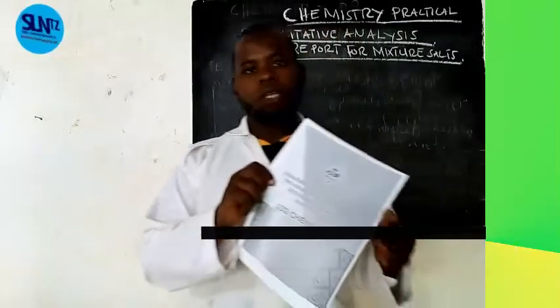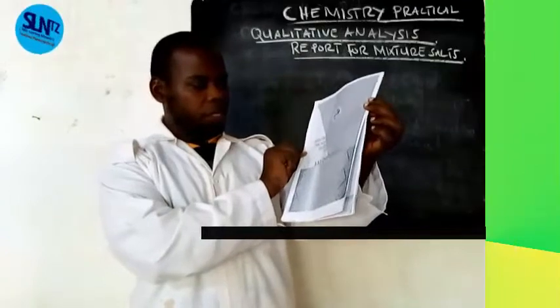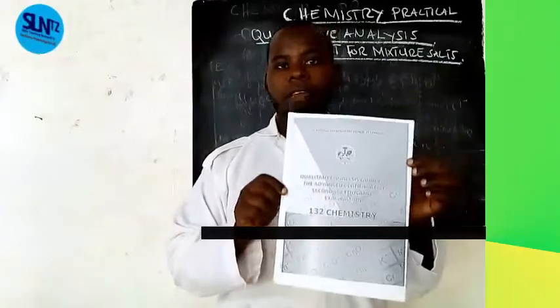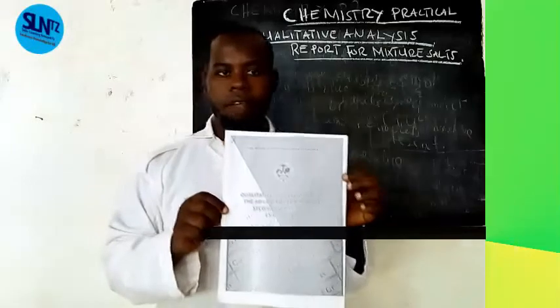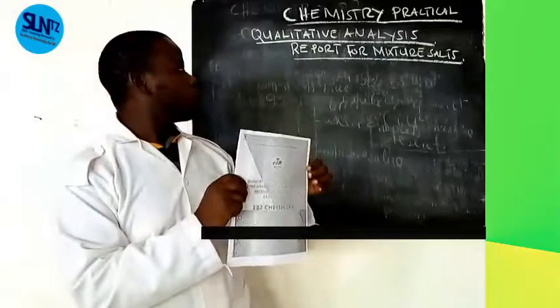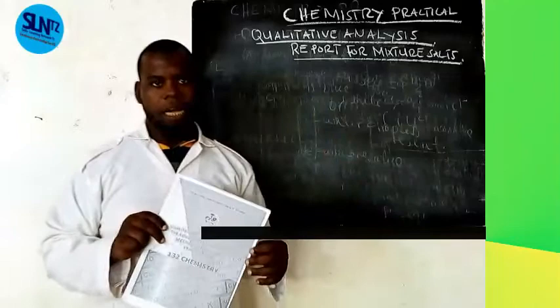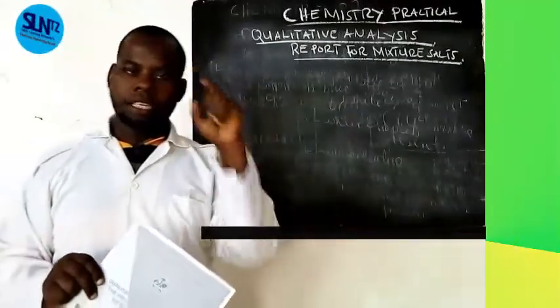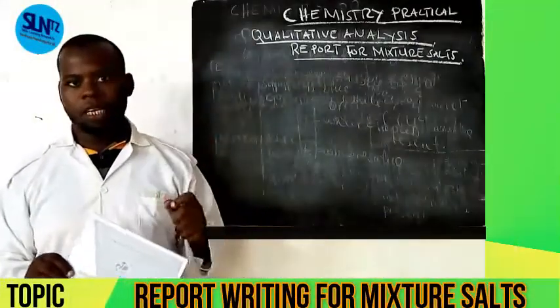When you use your sheet, I have the sheet for the Advanced Certificate of Secondary Education examination, as a guide for your testing, for finding the observations and the inferences. Using this sheet, I will show you directly how to write a report for a mixture salt sample. I'm sure this is a challenge for some students, so for now, I'm going to solve this challenge.